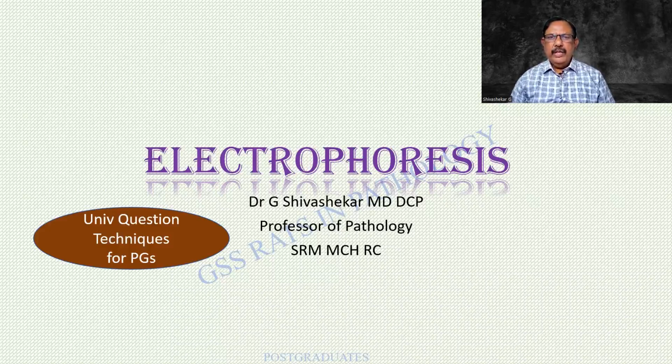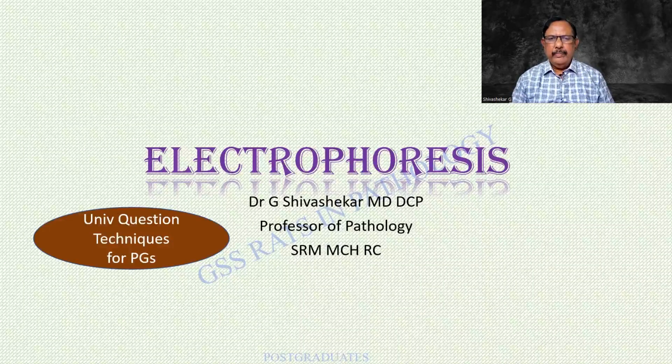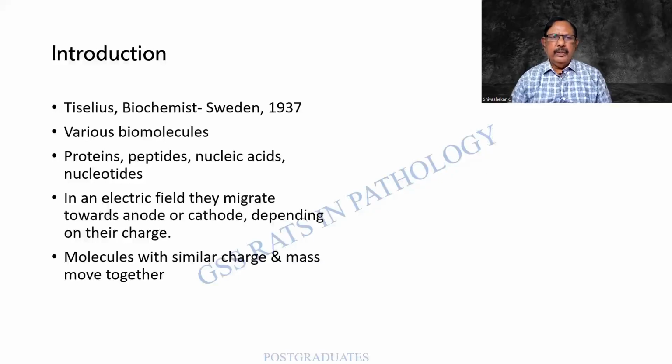The topic for the day is electrophoresis. One of my postgraduate students had requested me, and I took a plunge into it. The introduction: Tiselius was a biochemist in Sweden who first designed it in 1937.